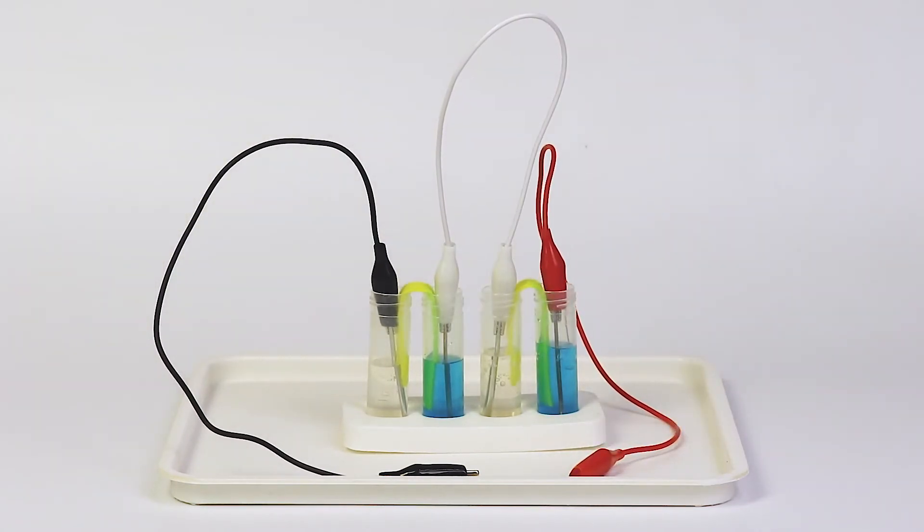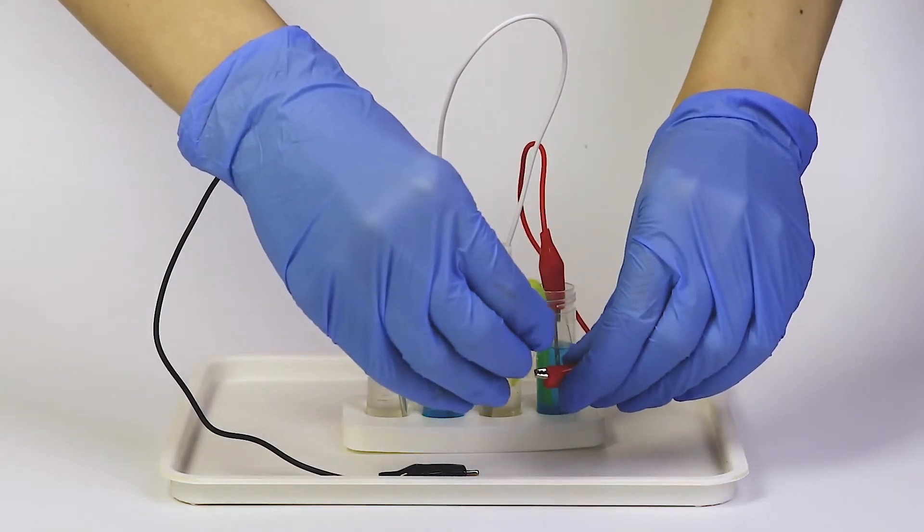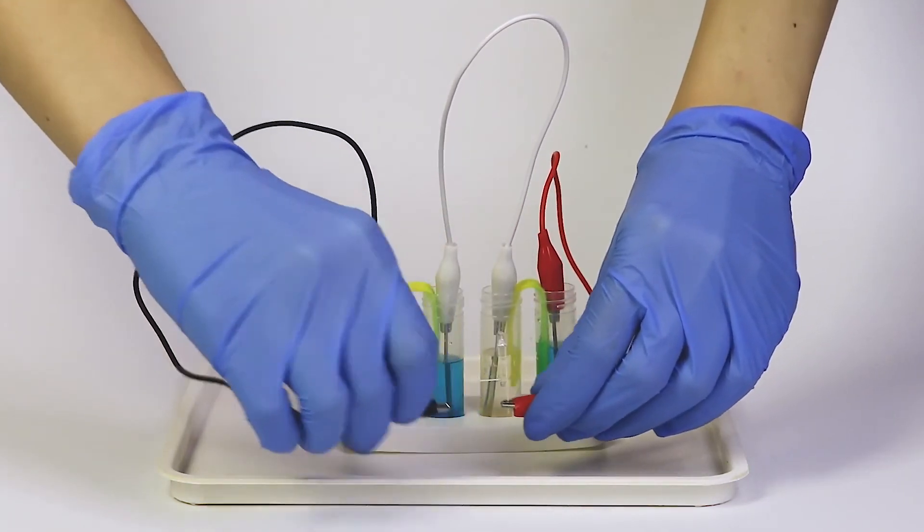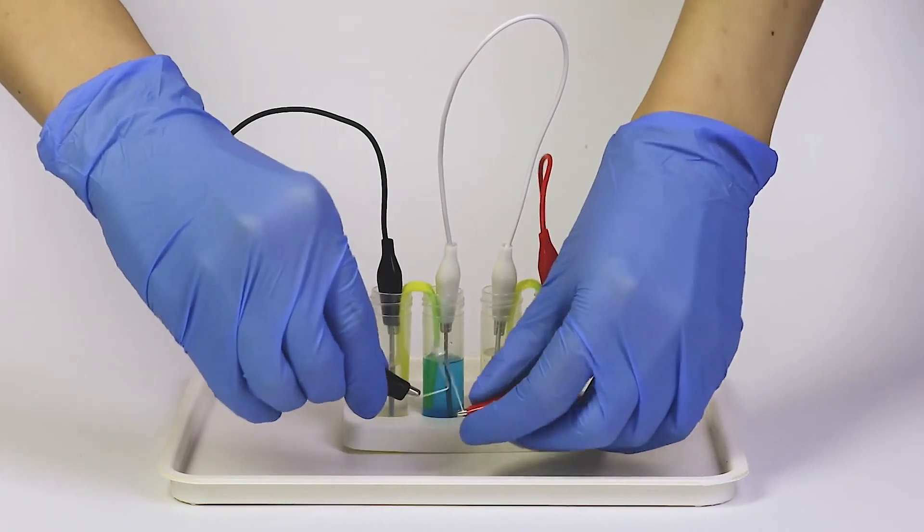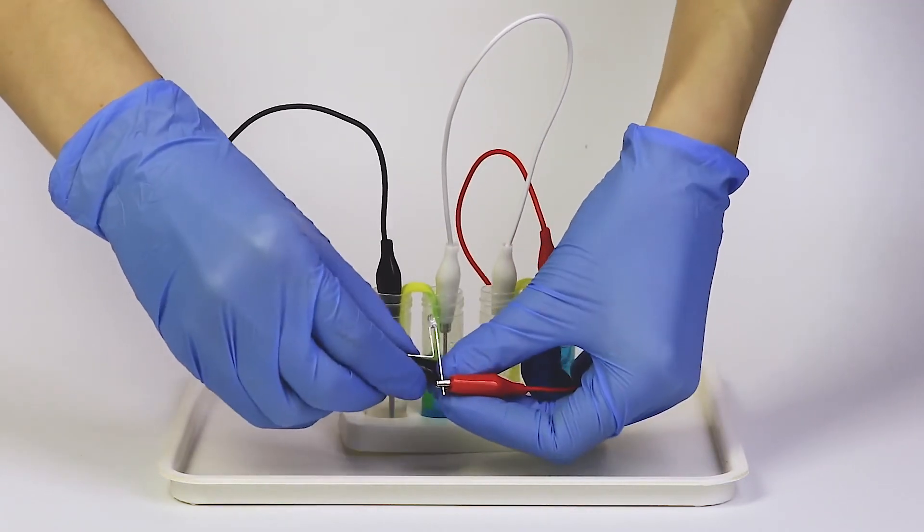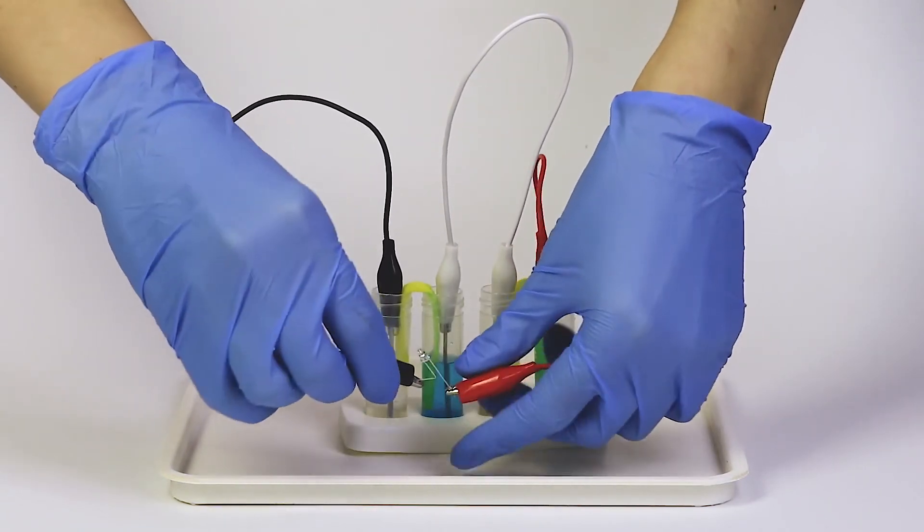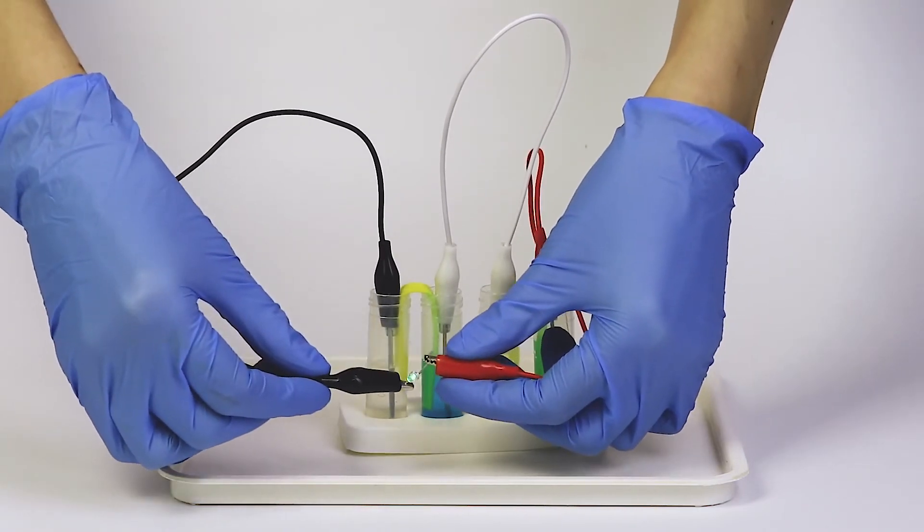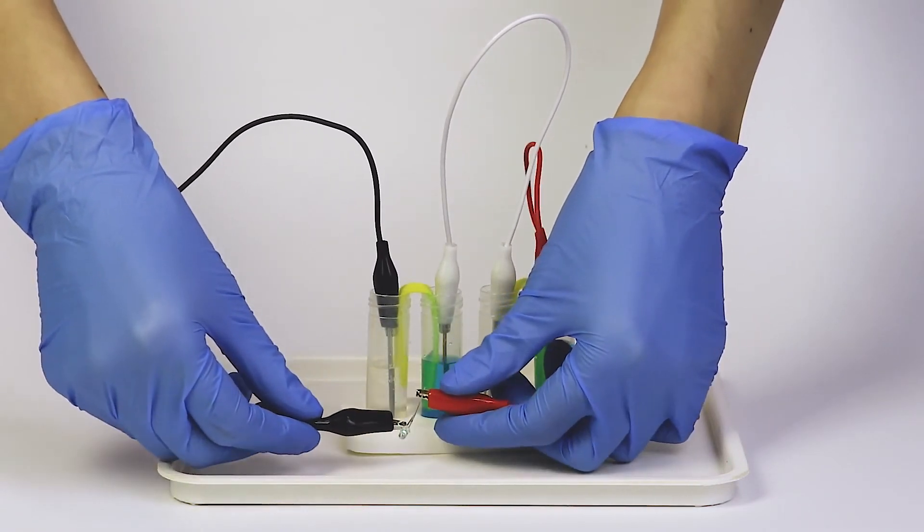Connect a free end of the red wire onto the long leg of the LED and the black wire onto the short one. The LED will light up, which means there is electrical current in the wires.